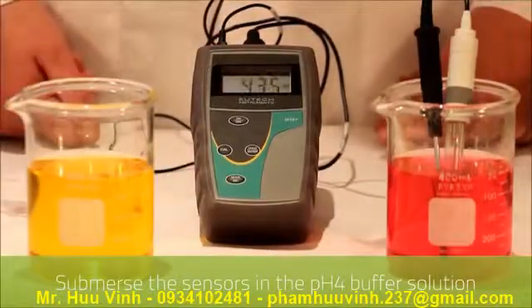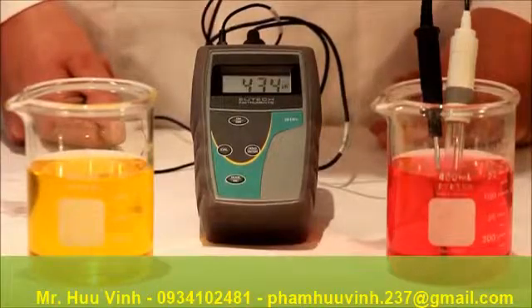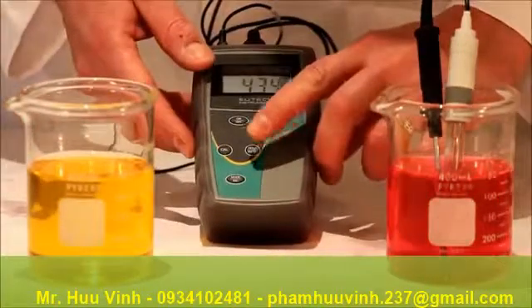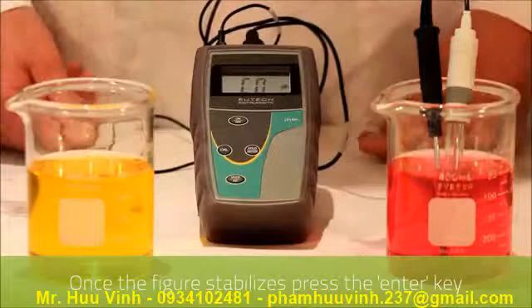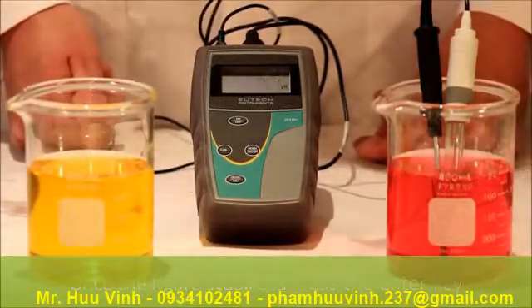Again you will see that the reading has dropped. When this stabilizes we again press the ENTER key. As you can see the reading has been adjusted to the correct reading.